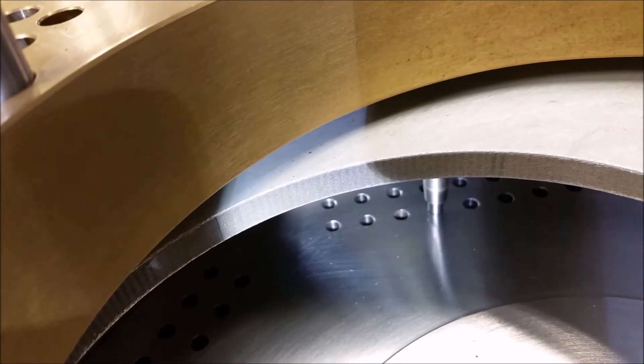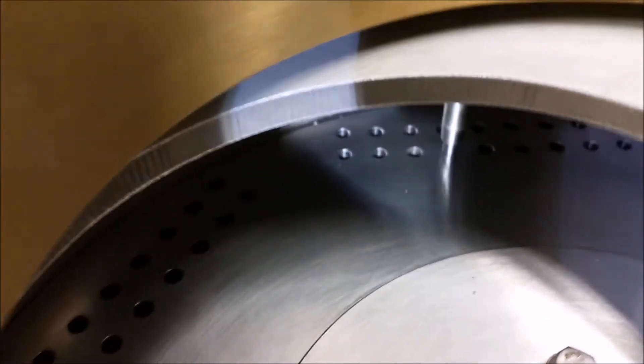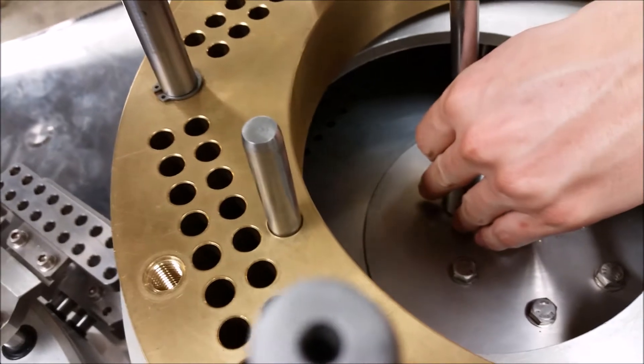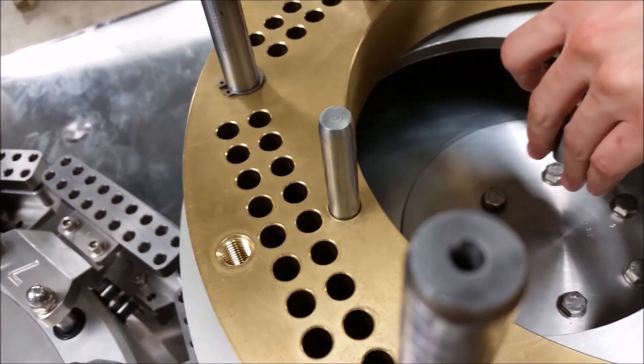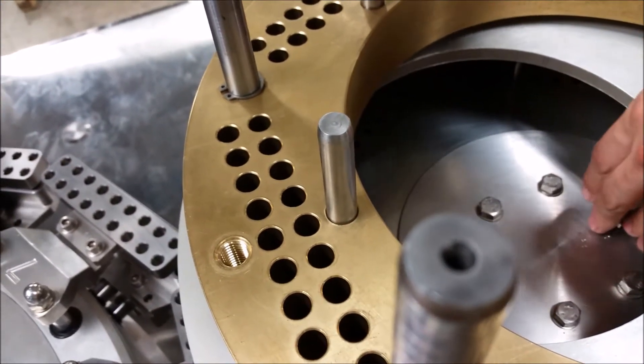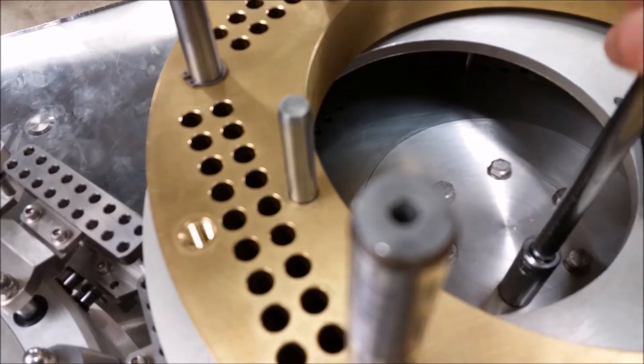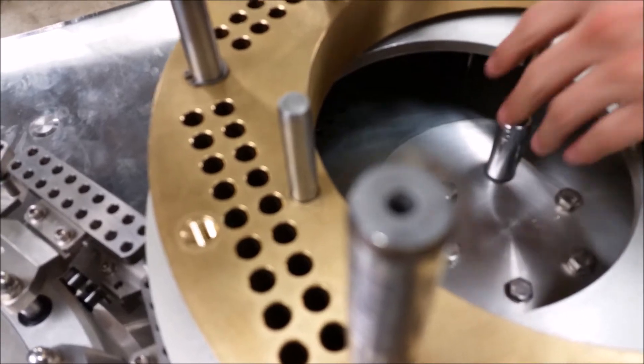Once you've got those in, go back to your bolts in the middle and you need to tighten them down in a star pattern so that it's pulling evenly on all sides. At first you don't want to tighten it a lot — just enough so that it's not moving anymore.